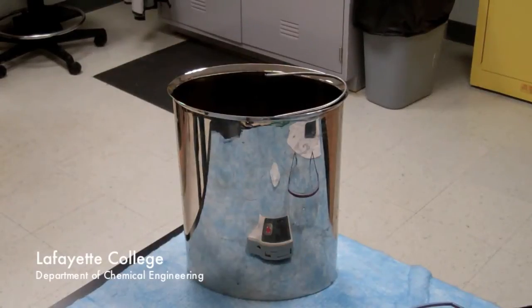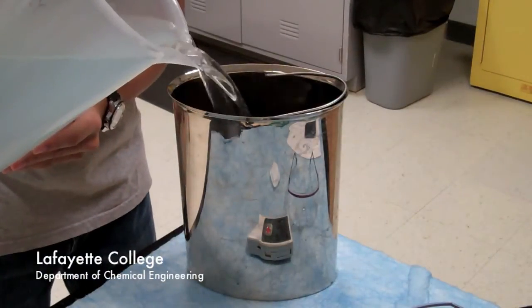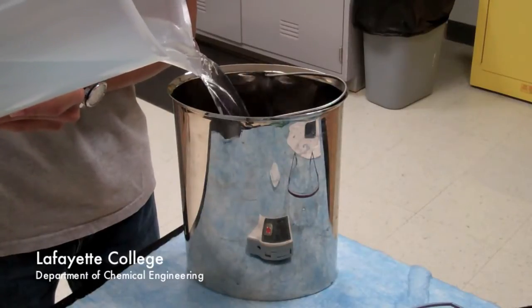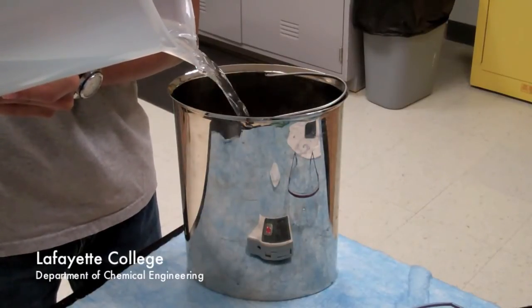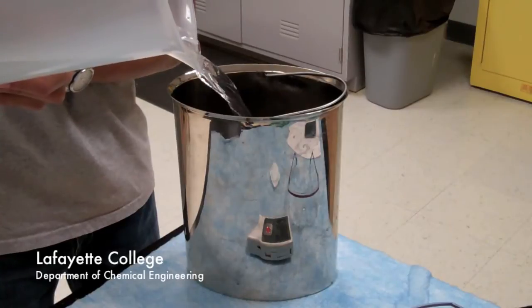The next step is to add exactly 2000.00 grams of deionized water to the dry calorimeter bucket. The best way to do this is to place the bucket on the top loading balance, tare the balance, and add the DI water slowly.